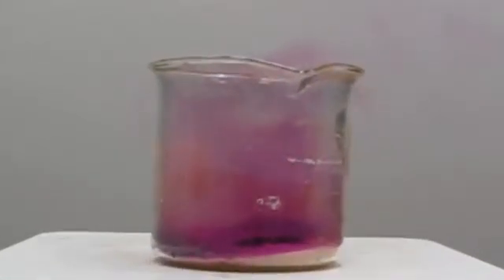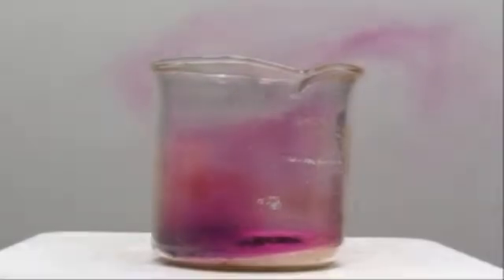You can see here that after a while, when that gets even hotter, we get a lot more of that purple iodine gas, which is escaping through the top of the beaker.